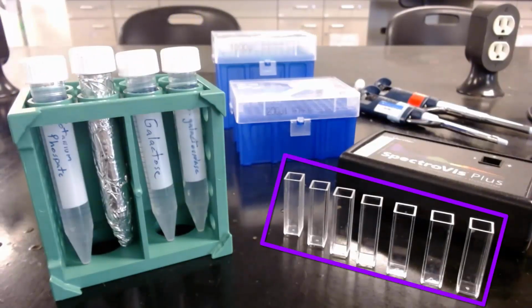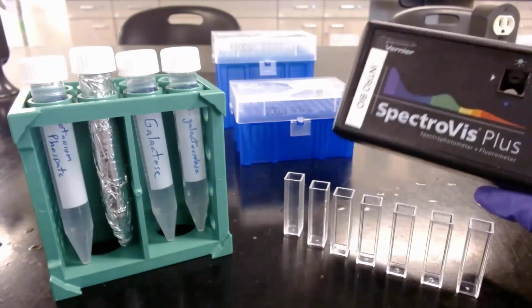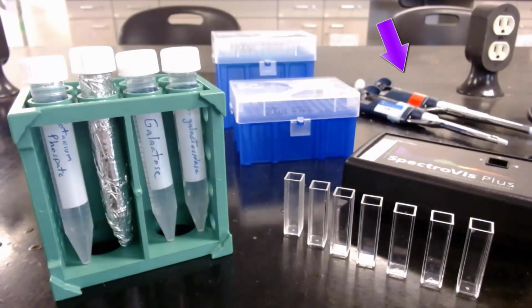Then we have our cuvettes. We'll be running our reactions in these. Our spectrophotometer, which will measure the rates of the reactions. And micropipettes and tips for transferring liquids. Before we run our experiment, I want to talk about each of our reagents.